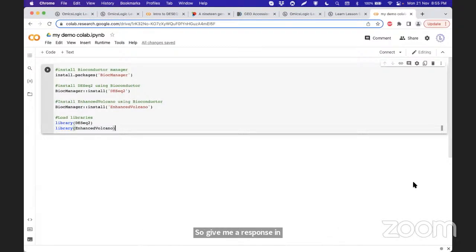It will install easily from 2 minutes to 4 minutes, depending upon, maybe many of us are using it, it might take a little bit longer, so we will use the time to discuss the data. Okay, yes, some more yeses. Is everybody here? Is it running? Is it working, or is anybody getting a problem? This is an absolutely necessary step for us. Installing, very good.